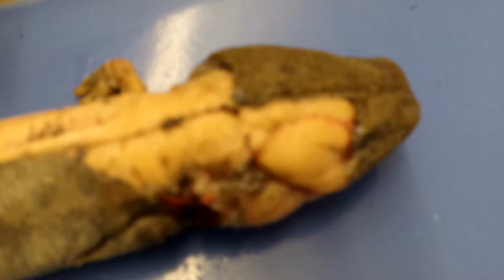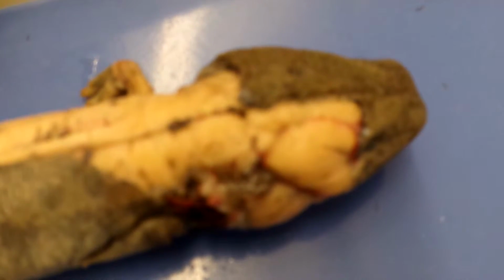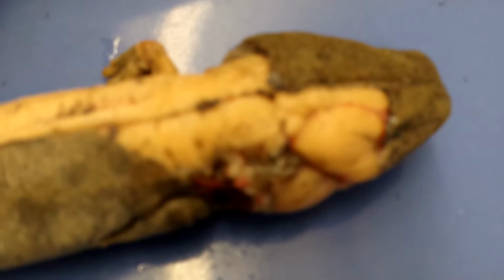The next is the adductor mandibulae externus, which is found here. Its origin is the parietal, its insertion is the dentary, and it is also homologous to the levator palatoquadrati adductor mandibulae preorbitalis in the shark.